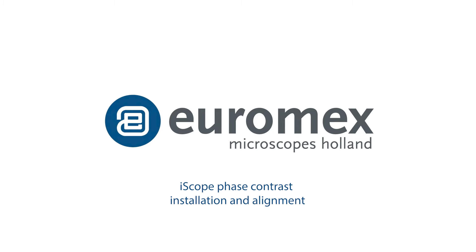How to install and set up a Zernica Disk Phase Contrast Kit with an iScope Microscope.